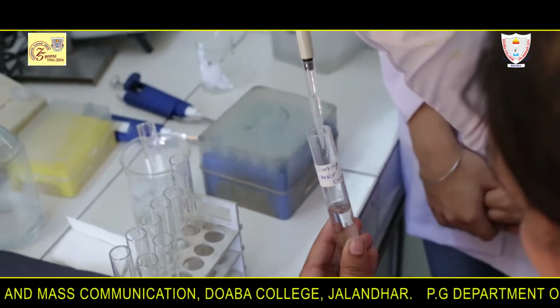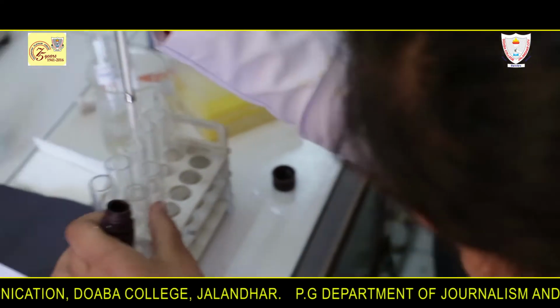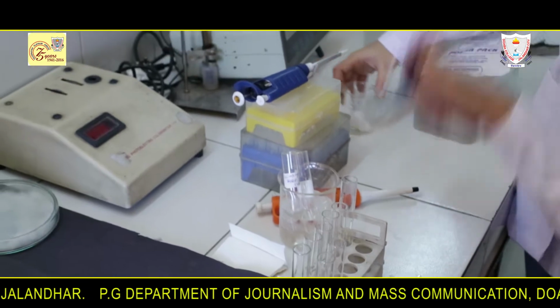HRP is horseradish peroxidase. In tube 2, add guaiacol, H2O2, that is hydrogen peroxide, and enzyme.